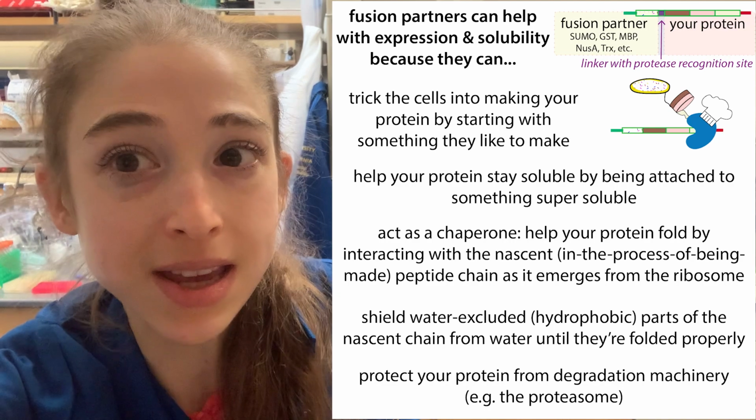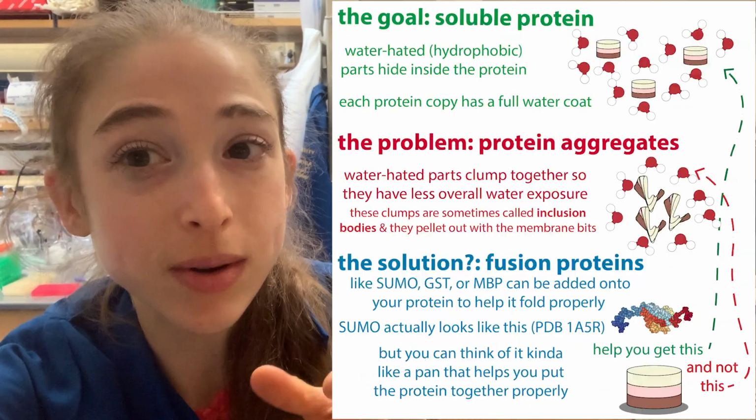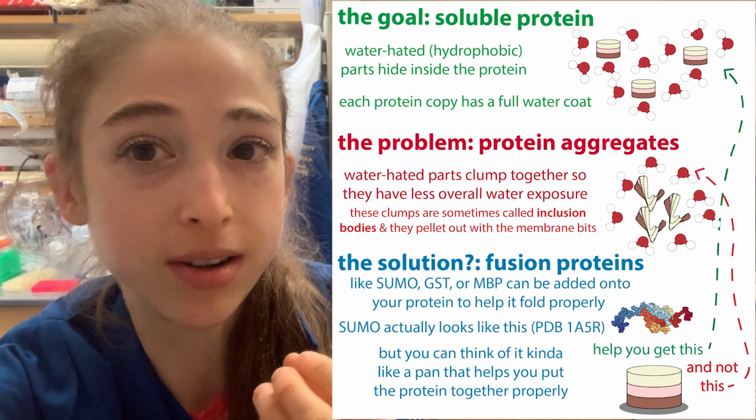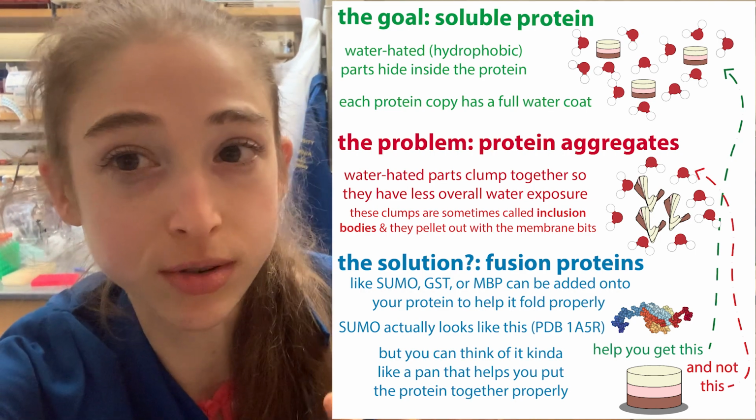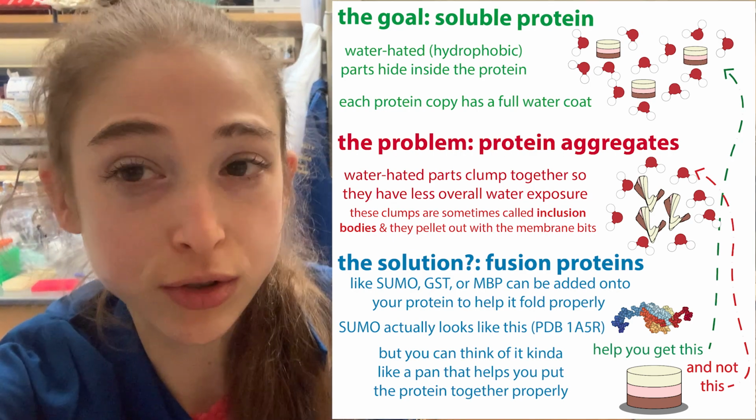And they don't just like making it, but it actually folds up really nicely and it stays soluble. So it can help your protein stay soluble and help your protein fold as your protein is getting made. And so today I want to tell you more about these fusion partners.